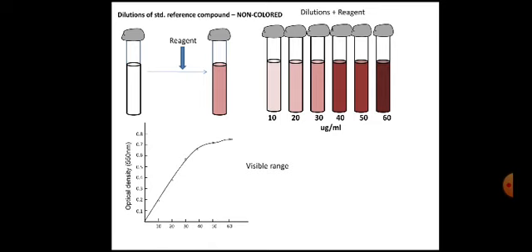In this case, take the fermentation product, that is the pure compound, the standard reference compound, allow it to react with the reagent, and then expose it to different wavelengths, and then check which of the wavelengths is absorbed maximally in terms of optical density. Higher is the optical density, higher is the absorbance.